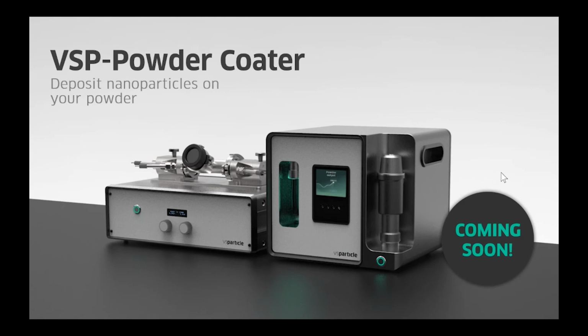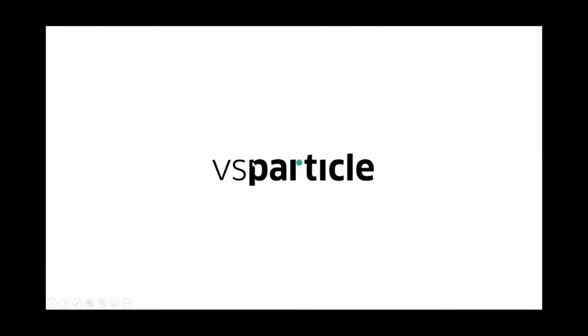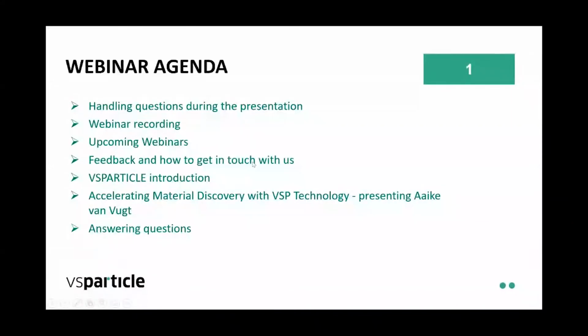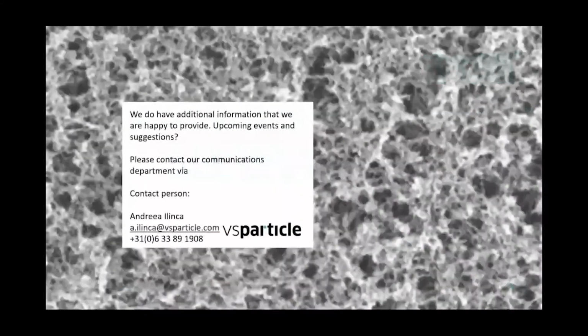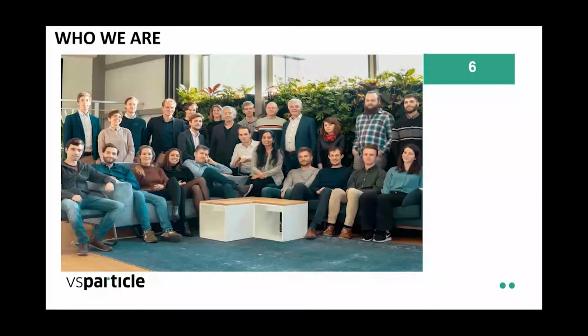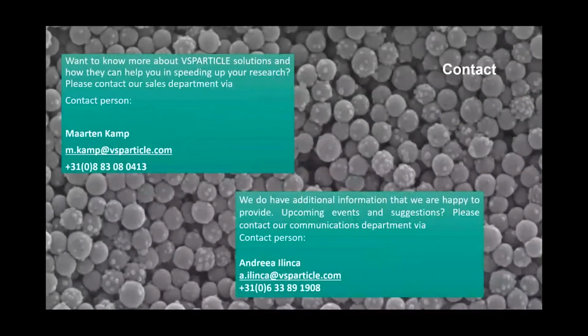If you look into the research, there are a variety of different techniques that you can use. The most common technique, I think, is colloidal synthesis, because it's the most convenient one. You just order some glassware and some chemicals, and if you have a synthesis lab, you can start trying to synthesize the nanoparticles. Even though the barrier to use the technology is relatively low, it's highly complicated. So optimizing your chemical recipe takes weeks or sometimes even months, and the reproducibility in those methods is relatively low.